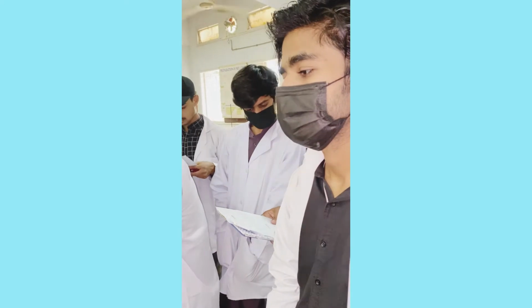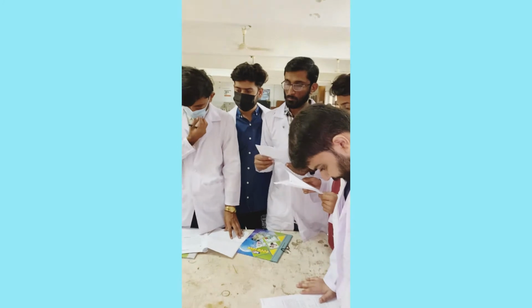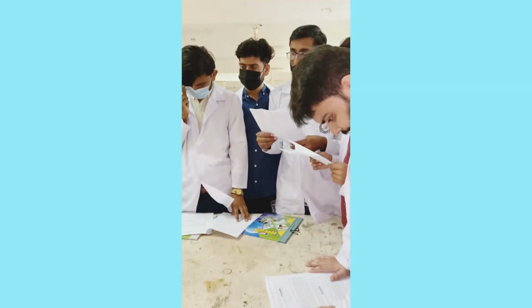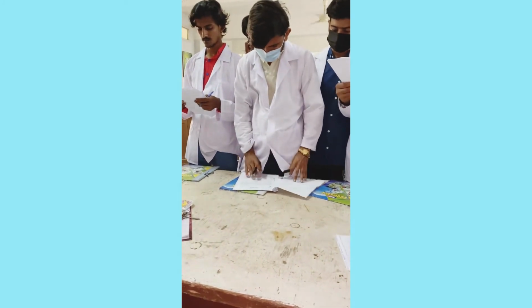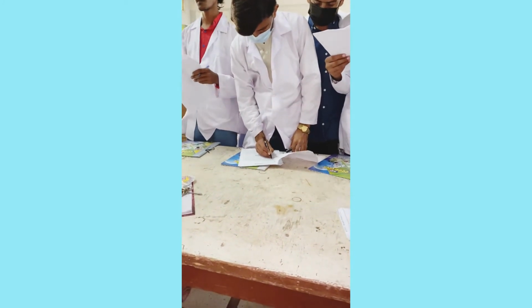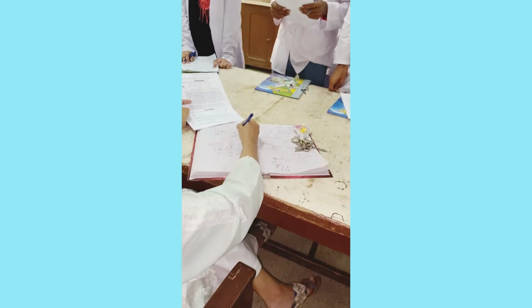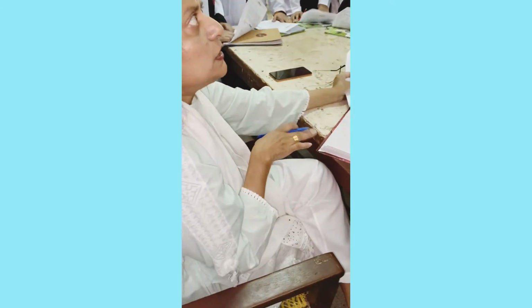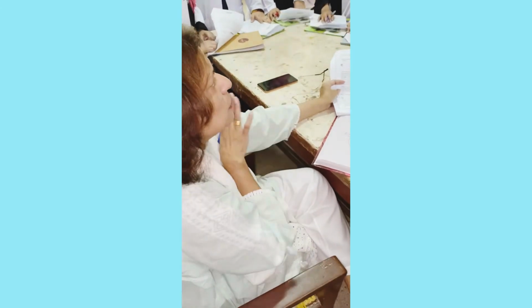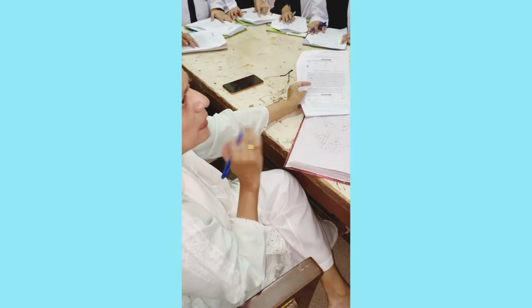Now add this nitrating mixture to the solution of acetanilide in acid drop by drop with stirring and keeping the temperature below 10 degrees centigrade. Underline 10 degrees centigrade. Now you are going to add this mixture into this acetanilide mixture, and the temperature should be below 10 degrees centigrade. It shouldn't be 9 degrees, it shouldn't be 8 degrees, it should not hit such a high temperature range. It should be 6 to 7, that's it.